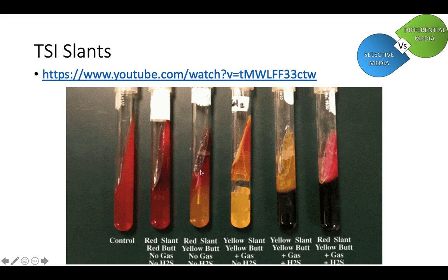So you look at this guy and you go, oh, this bacteria is able to eat glucose, but he cannot eat sucrose or lactose. He started eating the proteins. So that's a good informational step to tell you what you're looking at to diagnose this particular species of bacteria. It can eat glucose, but not lactose or sucrose.